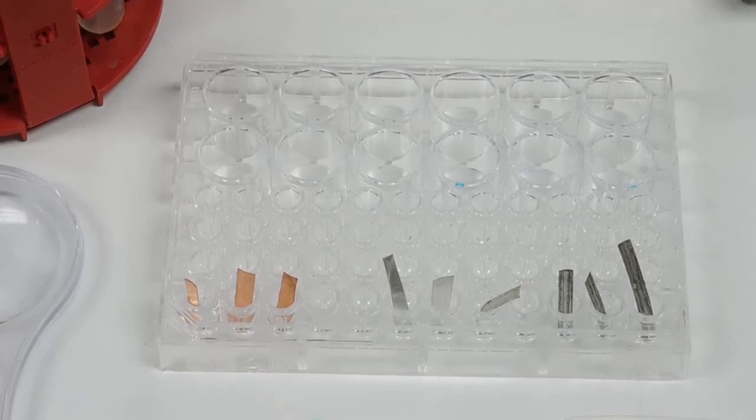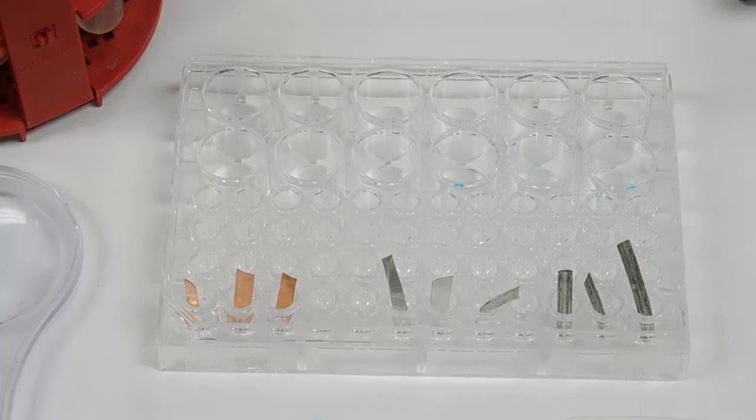When I'm done with all of this, I can take the metals out, rinse the metals with distilled water, dry the metals, and place them back into the little weighing dishes with the appropriate place to put them. And then I'll take the micro well plate over to a sink with running water, shake the solutions that are in the well holes into the sink, and rinse each of those well holes with distilled water a couple of times and shake to dry. Put everything back where I was working.